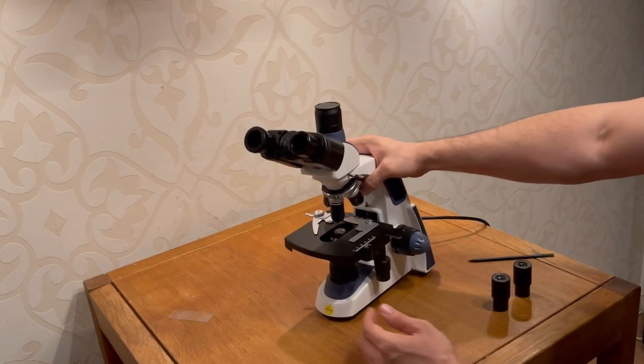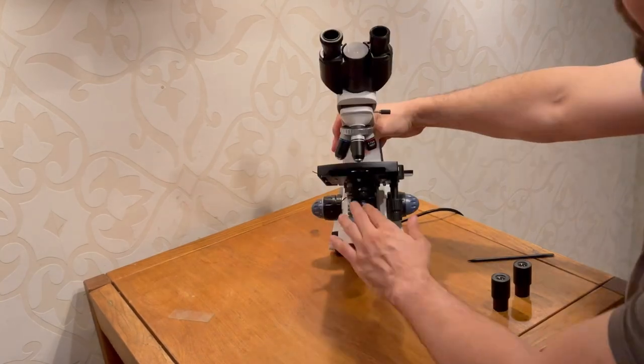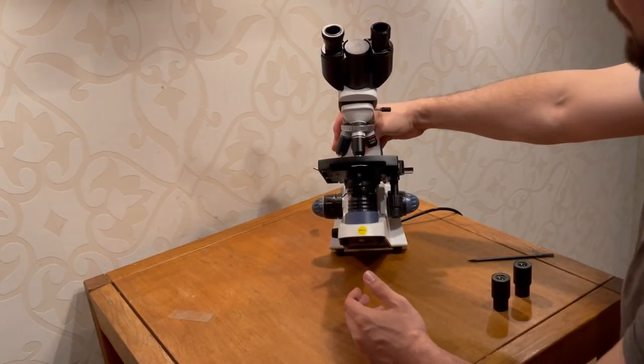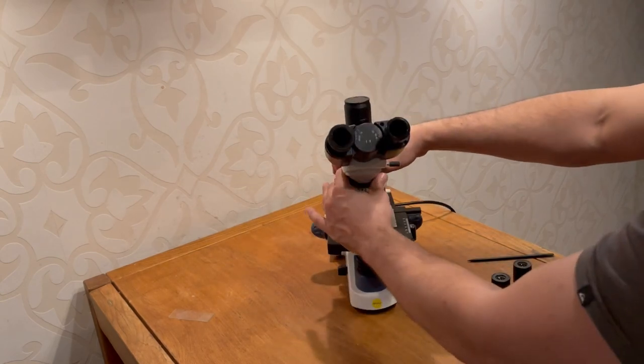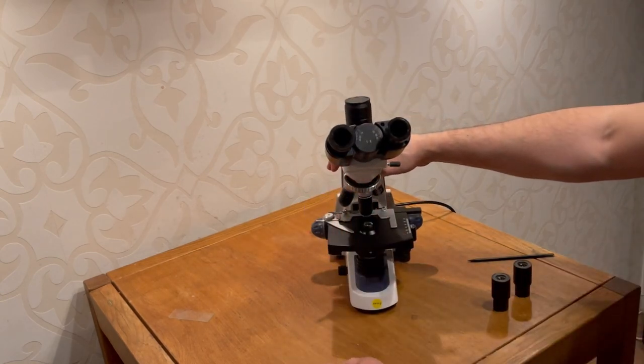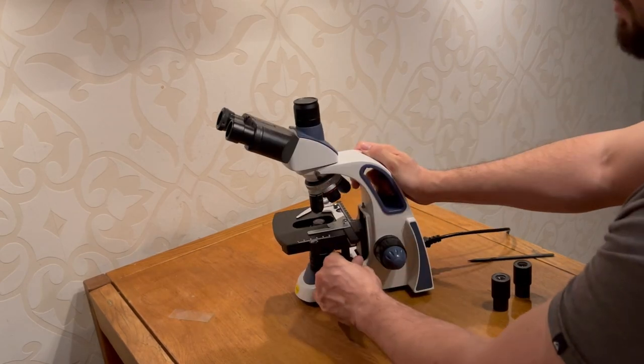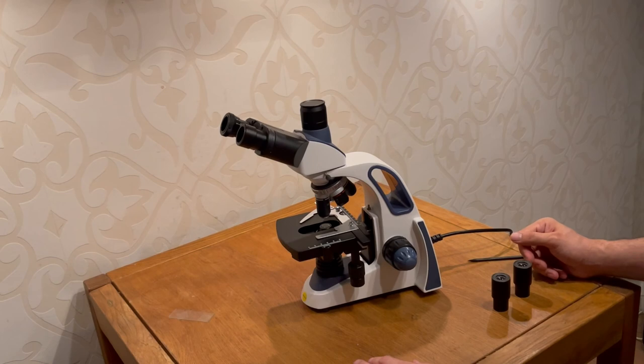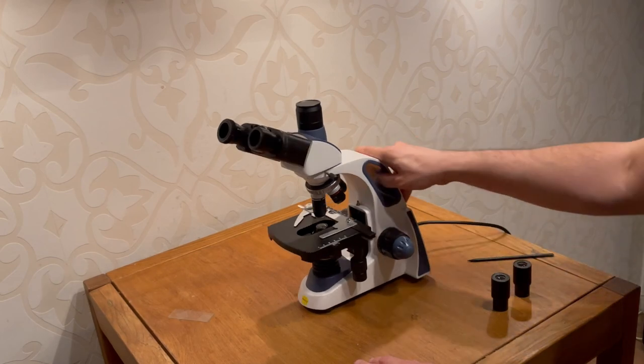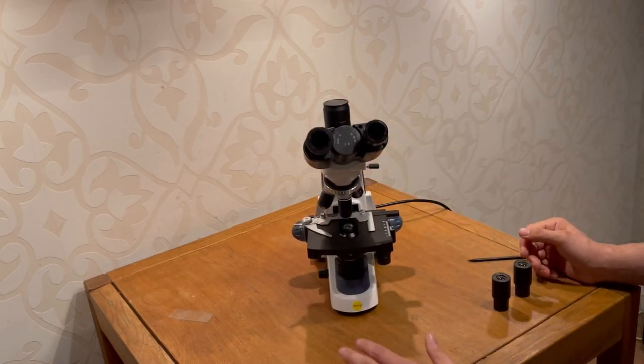But this thing, the not-coaxial diode and the table, the adjusting knobs, this spinning thing, they are something. So, consider that. It's a handy tool. It's a bit of more care and love that should be put on this one. And then, it's going to be a great, really great purchase.